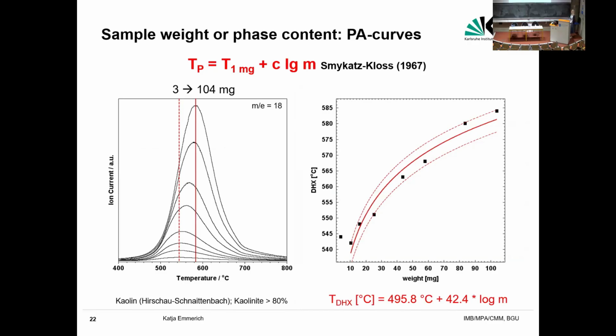Influence of the sample weight in your crucible. And very often, if you compare your data with data found in literature, the sample weight is not reported, or people don't take care that they always apply the same amount of sample when they want to compare their data. Yeah, if they have like 10 samples they study, sometimes they apply 20 milligram, sometimes 30 or 40, and then it's really hard to compare the curves that you measured.